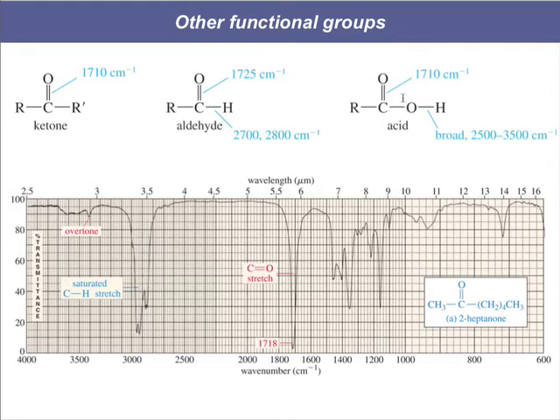When you're looking at NMR, it can be difficult to tell, say, an ester from an ether. But with the ester, you would very clearly see a carbonyl stretch that you wouldn't see from an ether. So IR can tell you important information that is often ambiguous in NMR.